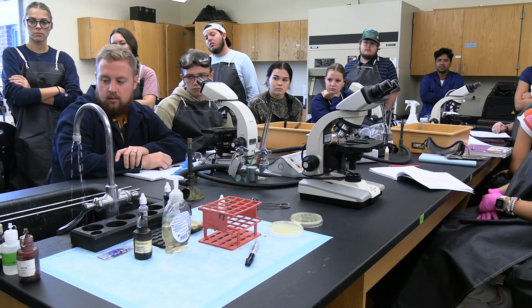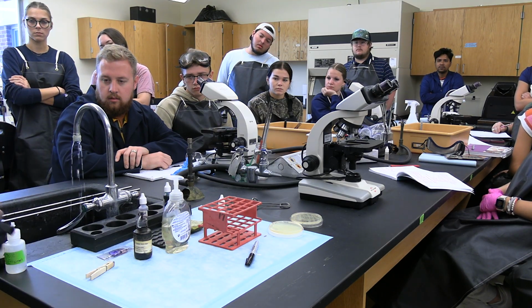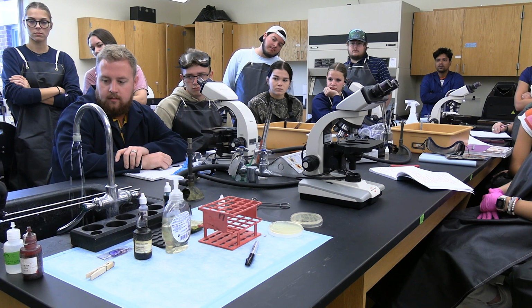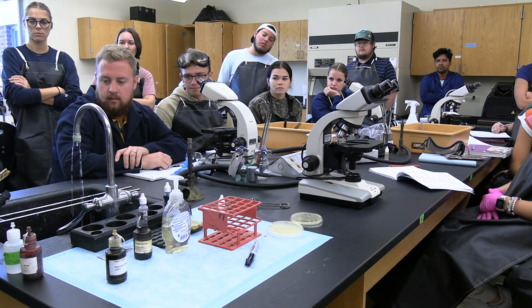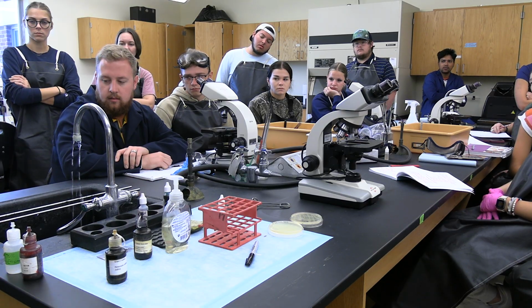Then second, we add gram iodine. We want to make sure the crystal violet stain stays strong. That's why we call it a mordant. 60 seconds again. Let's say the time is ready. So rinse.